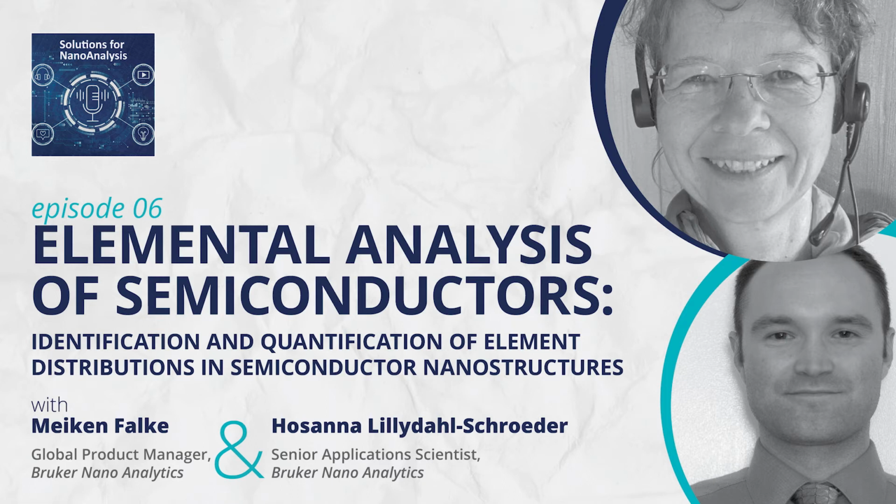And then these thin layers sit on top of each other to build, for instance, thin resistors or diffusion barriers or interconnects. And then it's important to see, are they where they are supposed to be? What happens at the interface of these structures? Are there any failures? And that is where EDS is a really powerful tool.